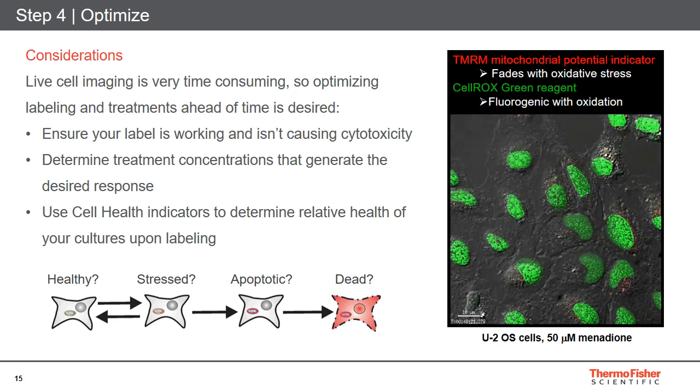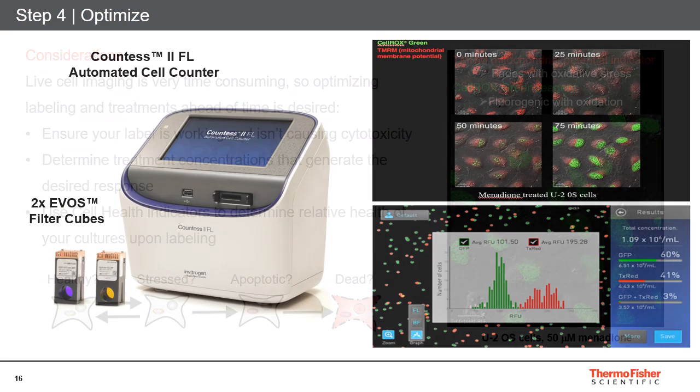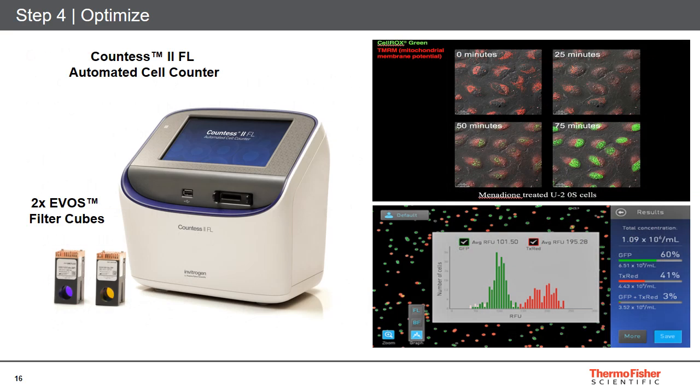And we now see that as the cytochrome C is being displaced, and we get this uptick in reactive oxygen from the menadione taking effect, we see that the positive signal from the CellROX, the reactive oxygen species sensor, starts to come on. So this is a really elegant and effective way to investigate the health of your population by using a combined approach, one that gives you a readout for healthy cells and one that gives you a readout of toxic cells.